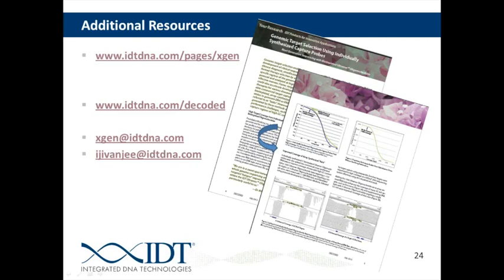the way that you're calculating the quantification of your material. There are some people that will not use any enrichment techniques for quantification, and there are some people that are comfortable using some enrichment techniques. It really comes down to the level of specificity that you need in the specific organism and specific DNA that you're working with.